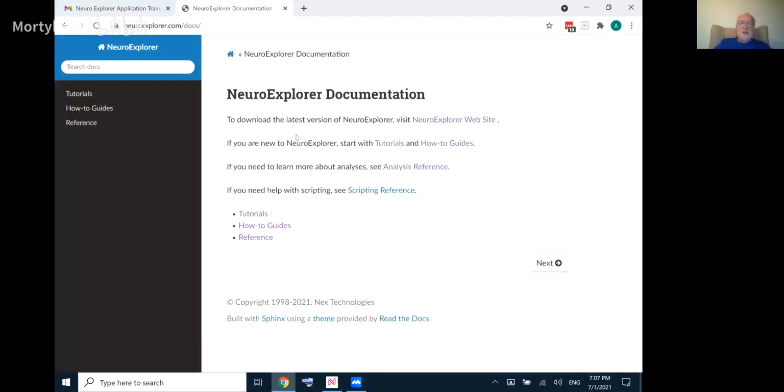This is a new documentation. We discussed with Eric that I didn't have it before. It's just brand new. I'm still working on it. The advantage is that you can translate it into Chinese if you want, because it's on the web. You can ask Eric how to do this. I don't have it since my Windows version is English. Google doesn't offer me translation.